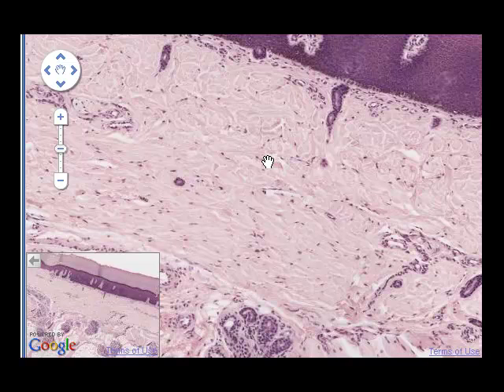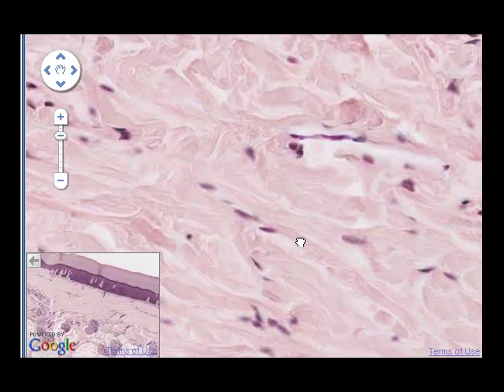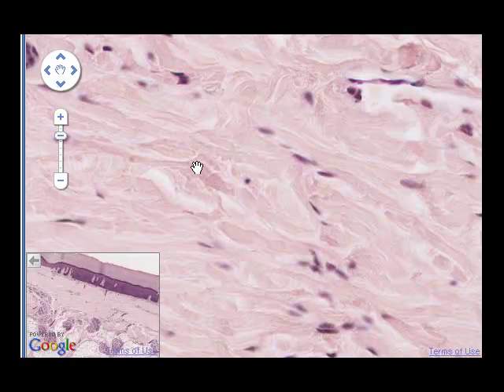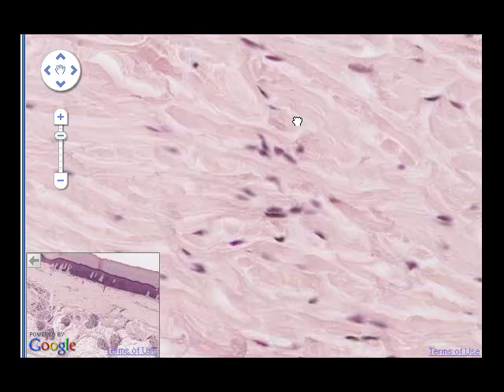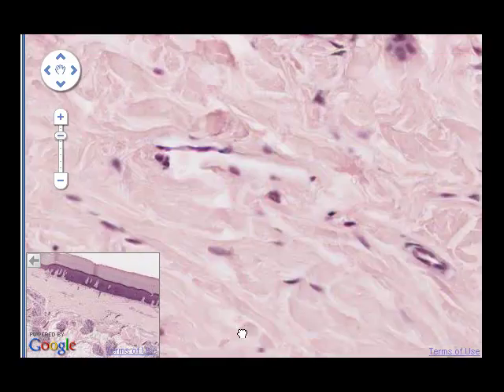And the dermis is made up principally of dense irregular connective tissue, and so this material we're looking at here is largely dense irregular connective tissue. We'll take a look at it in a little higher magnification now. And just as you will have been shown in the lecture, you can see collagen bundles. They are organized in different directions. Some of them appear longitudinally sectioned, some appear cross-sectioned. Interspersed among the bundles are cell nuclei. The majority of these cell nuclei will be from fibroblasts.